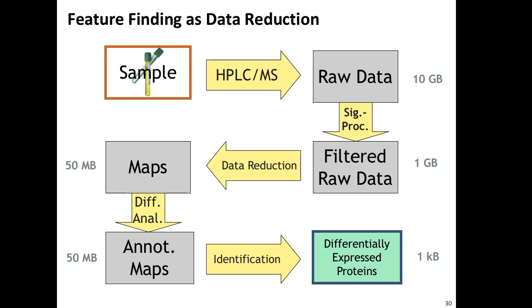Obviously, these samples should be comparable in order for them to be compared. That's where it comes from. If you try to align a yeast proteome with one from Arabidopsis, it's just not going to work.